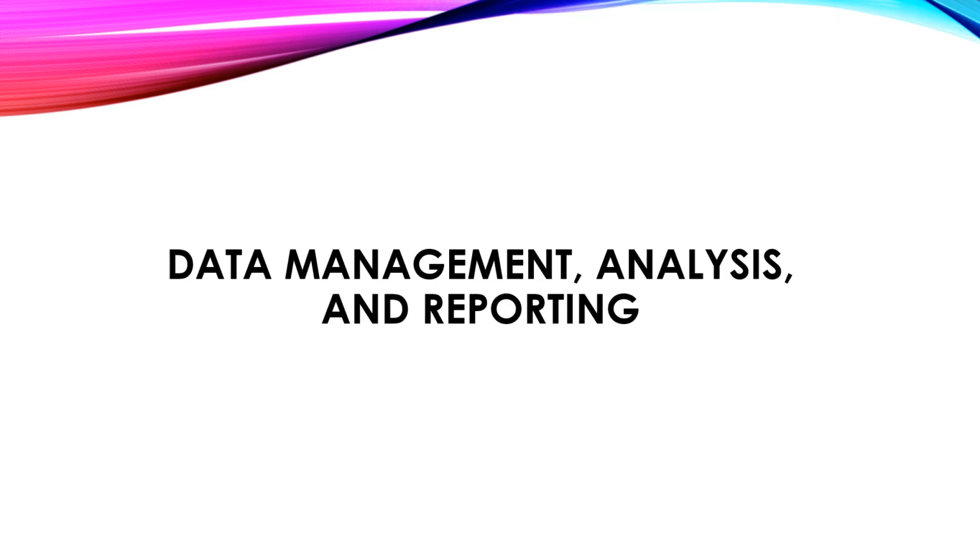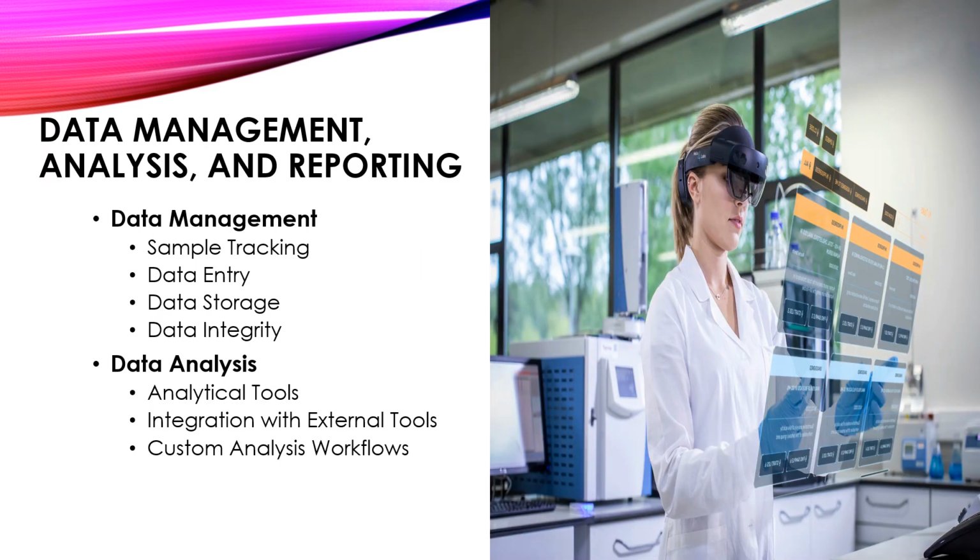Data management, analysis, and reporting. Now, laboratory management systems play a crucial role in managing data, conducting analysis, and generating reports within laboratory settings. And the following is an overview of how data management, analysis, and reporting are typically handled within a laboratory management system. The first is data management. Now, this involves sample tracking.